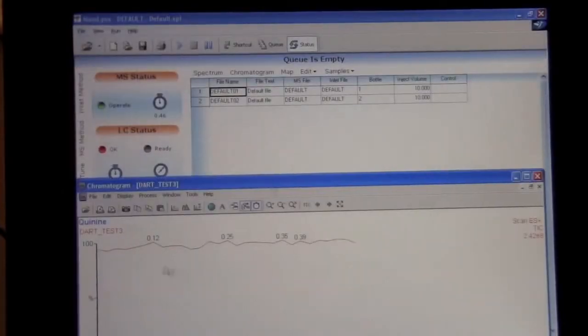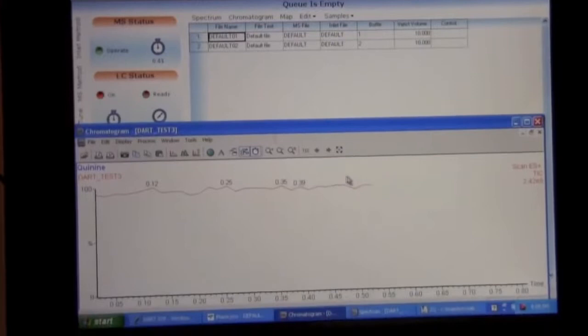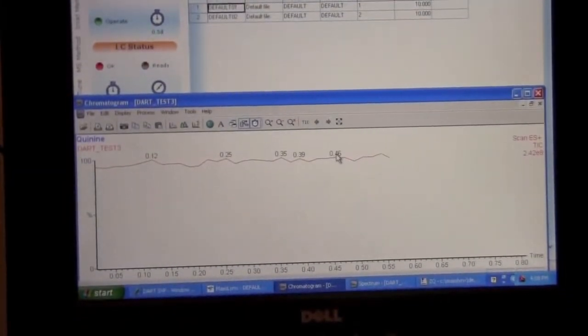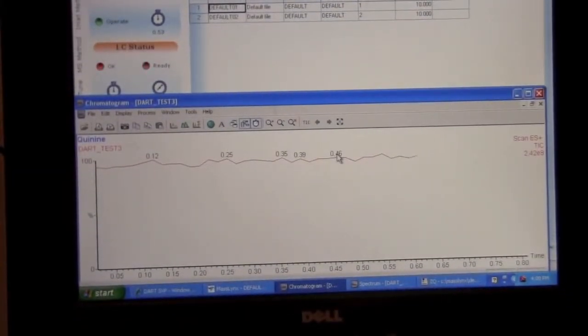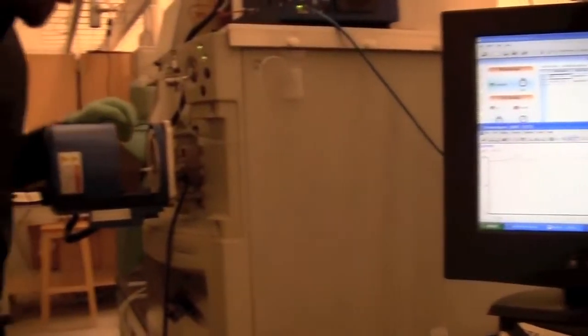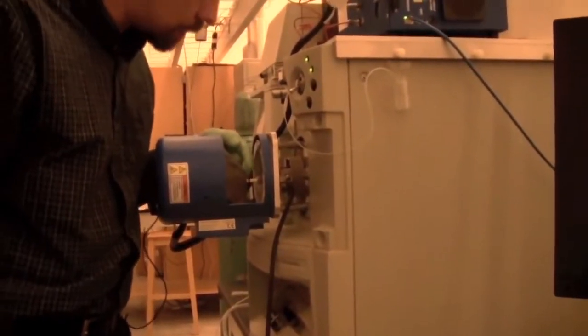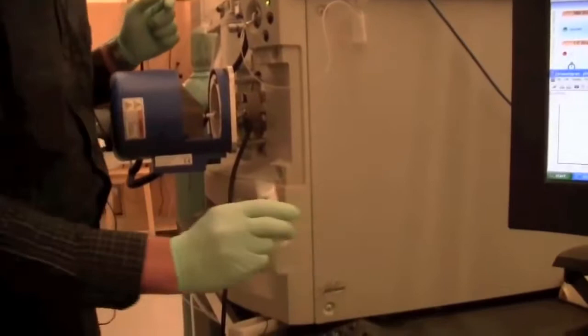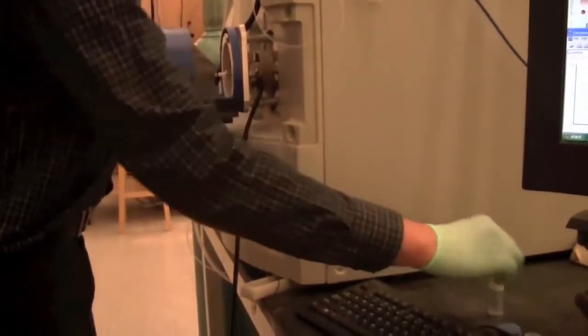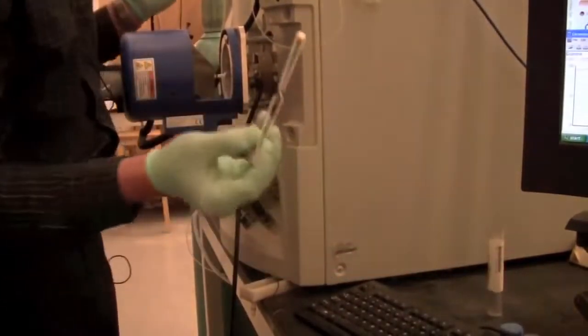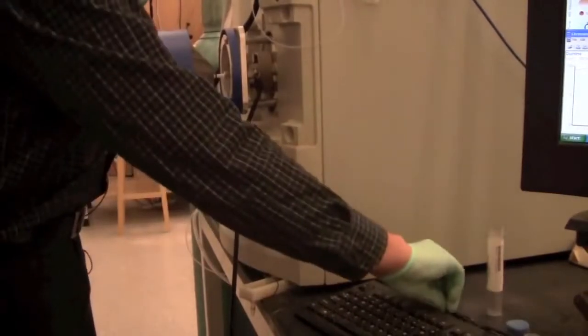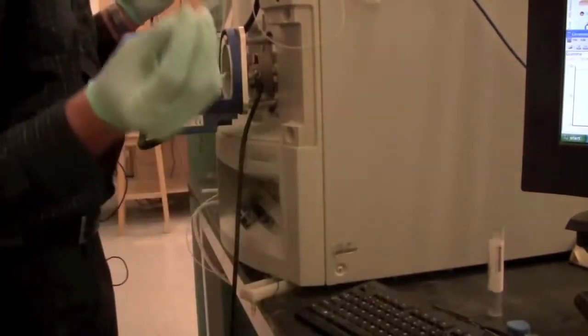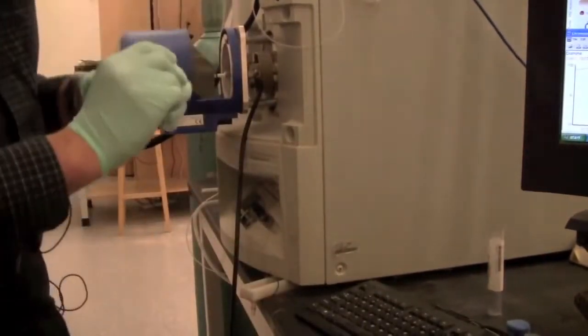So now we're looking at the chromatogram here and we can start to put the sample in. The sample is anything that goes in the gap between the source and the inlet of the mass spectrometer. So you can use a capillary. You could use a solid sample if you wanted to. Or you could use a sealed capillary. It often works the best.